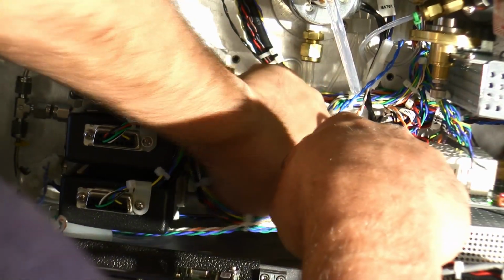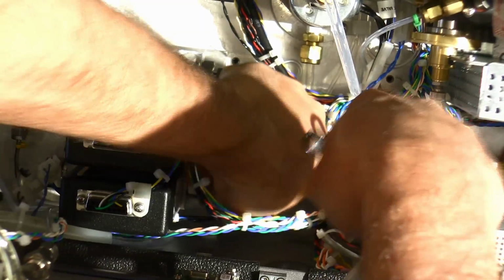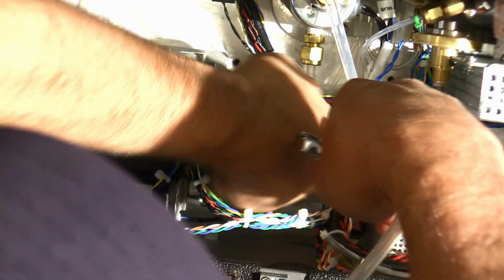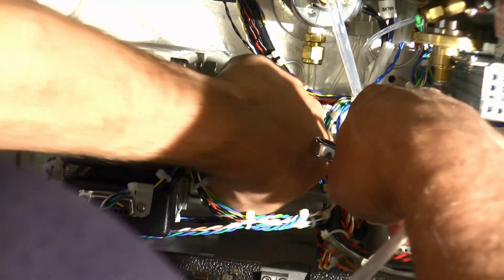Remember, this isn't something we're doing all the time. Use caution about where your hands are. Most everything is electrically safe in here, but it's good to do this and just keep an eye on things.